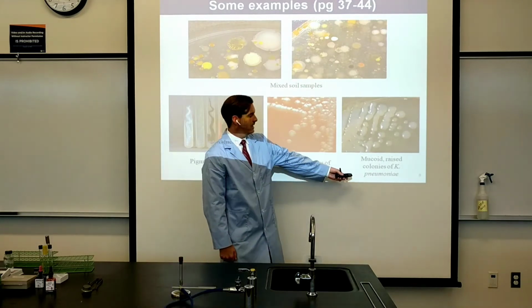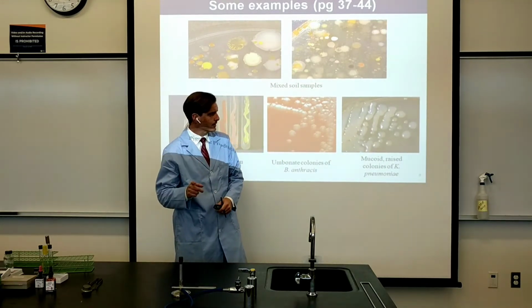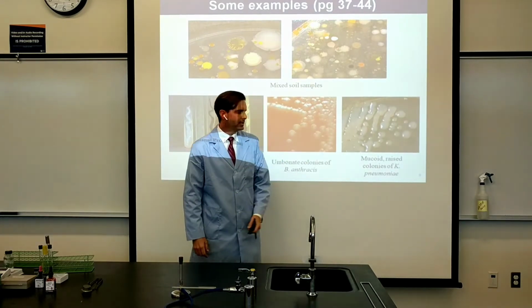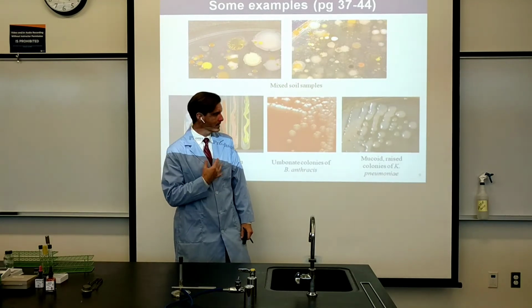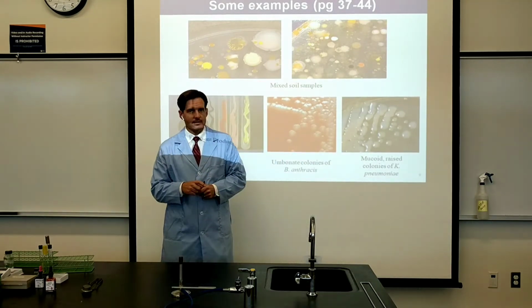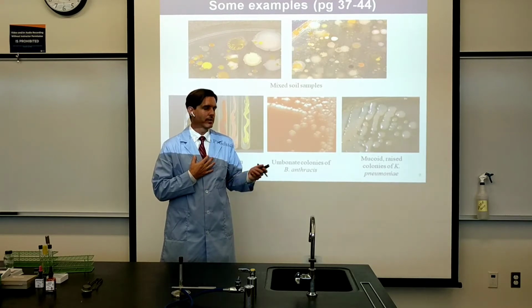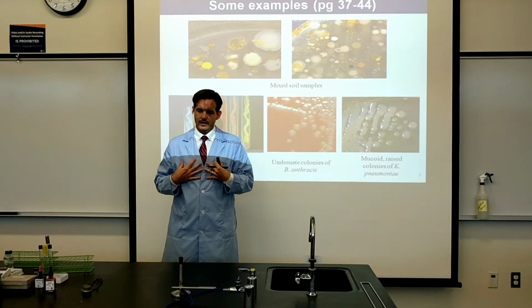By the way, I mentioned Klebsiella pneumoniae in my lecture earlier, and you can see that Klebsiella pneumoniae, which is one of the causes of pneumonia, fluid buildup in the lungs, has a mucousy, sticky surface, what's called mucoid, and that's because they stick really well to the lungs, and unfortunately that makes them very difficult for our lungs to fight off.